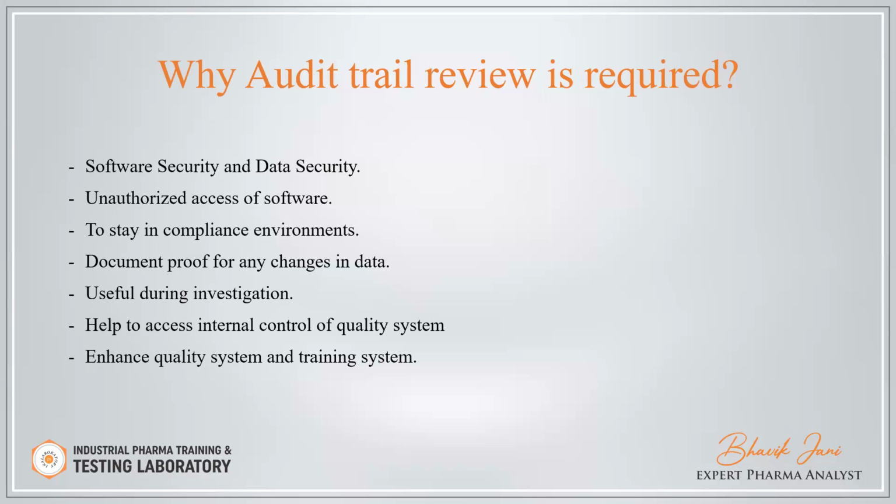First, software security and data security, preventing unauthorized access to the software, staying in a compliant environment, documented proof of any changes in the data, usefulness during investigation, and helping to assess the internal quality system and enhance the quality system and training system.